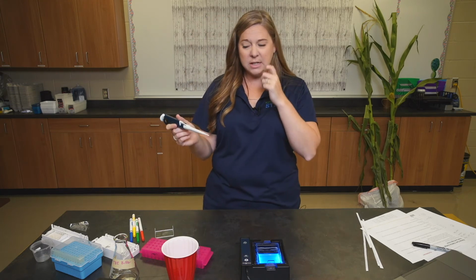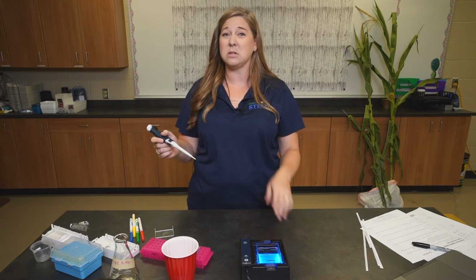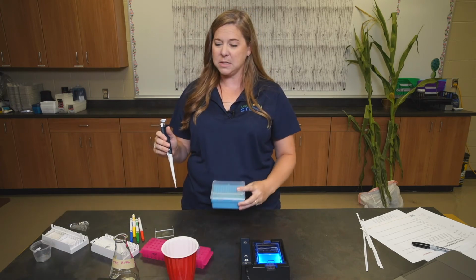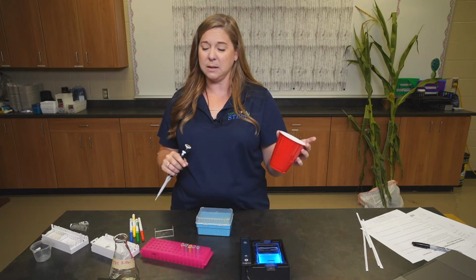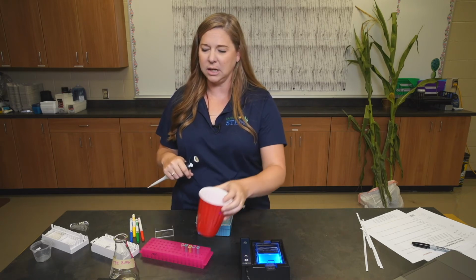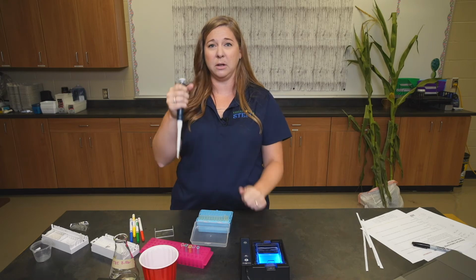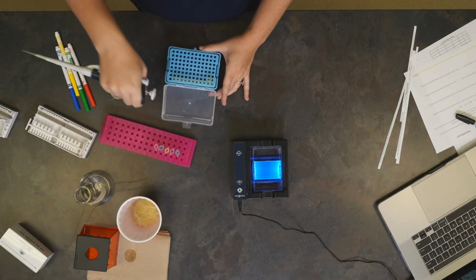One thing to remind your students is that when we use micropipettes, especially with DNA samples, we need to make sure we use a fresh micropipette tip every single time. Each group is going to need their own pipetter and their own set of tips. Another helpful tip is to give them a container to get rid of those tips in. It can be as simple as a solo cup, or if you don't have that, use a beaker and wash it later. To load your pipette tip, you simply hold your micropipetter with the little nubbin over your finger, and you're going to push straight down. Now we've got it on there.